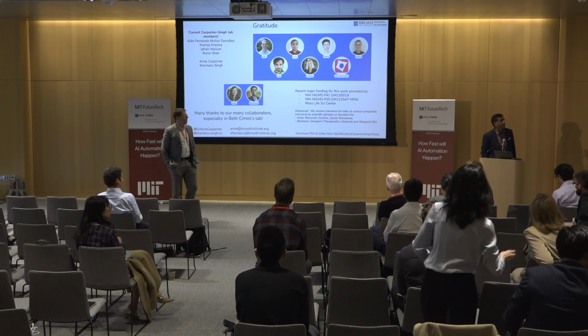The robustness of AI. So I think it definitely goes back to the same concerns that we discussed in the previous talk, which was someone needs to be doing the data curation part of it. All these 1.6 billion cells that I just mentioned that we have collected is beautiful data. It's a lot of data, but it needs very careful curation to figure out if there are systematic batch effects.